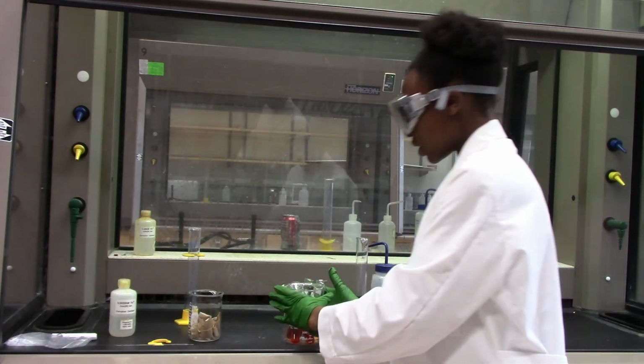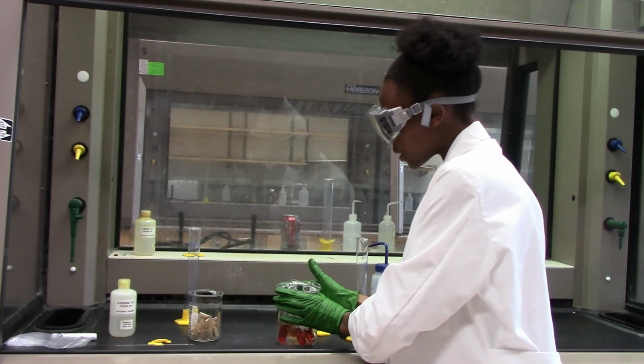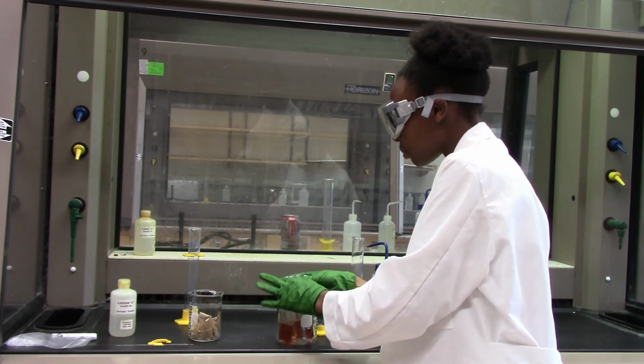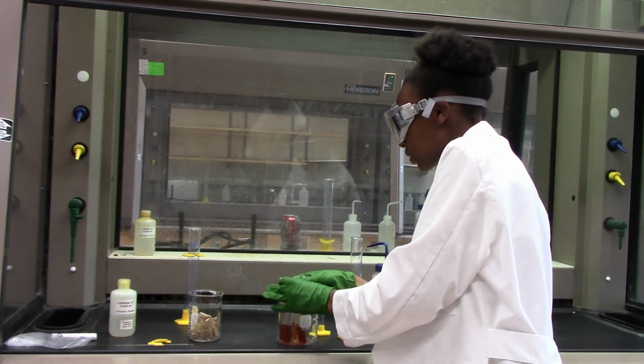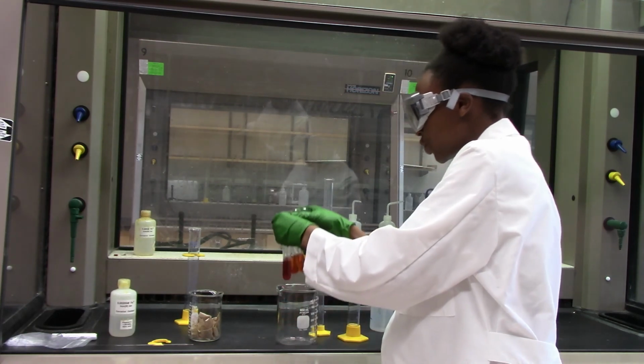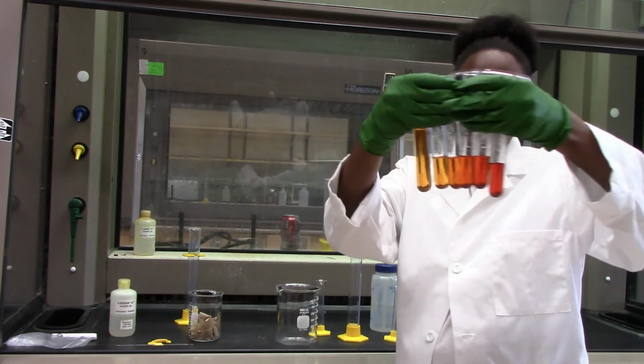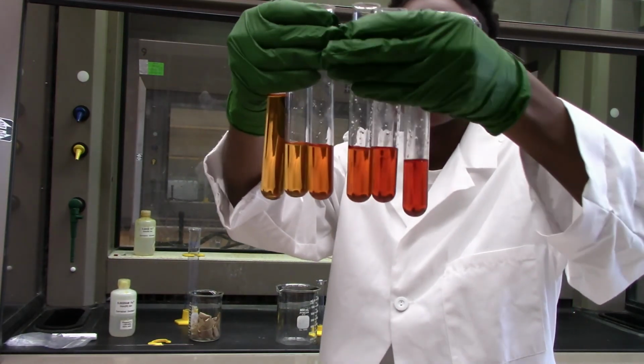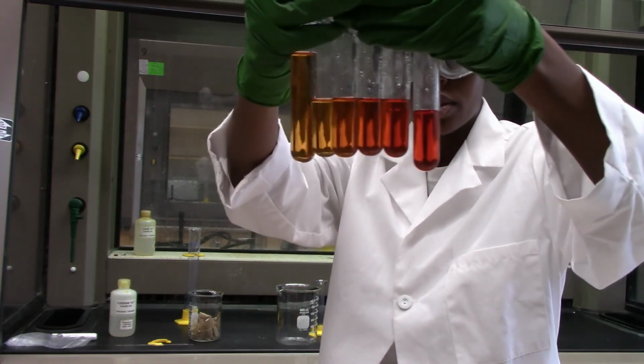Alright, so now I have all of my solutions, from the standard to the 5 different concentrations of my reactants. And I will just show you that they are colored, and that you will see that they have different colors.